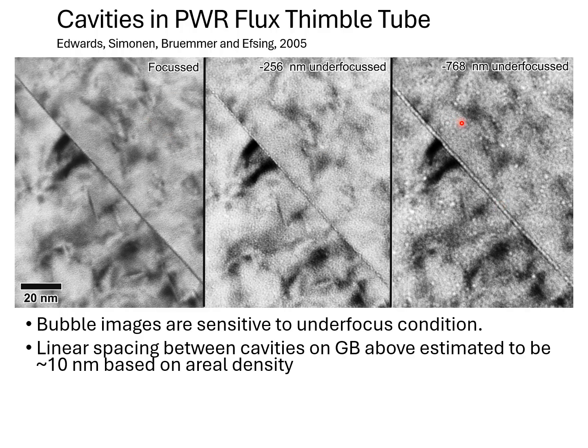But I know, having had to address the same issues in Inconel and seeing the effects, this isn't about focusing, it's about the alignment of the microscope.